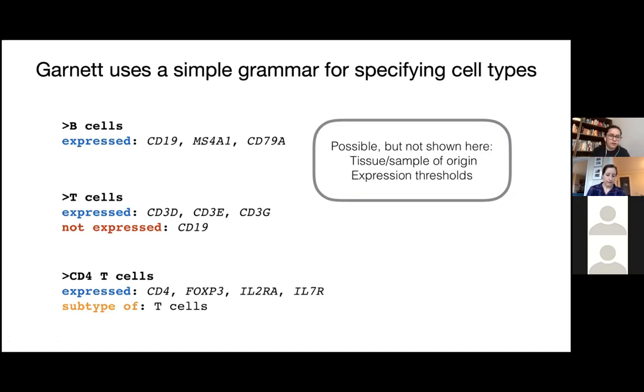And I'll talk a little more about this when we go over the markdown. So basically, it's a very simple file to start with. It's a text file. You can make it in any text editor. So you don't need any complex tool or very complex knowledge of R to do this.